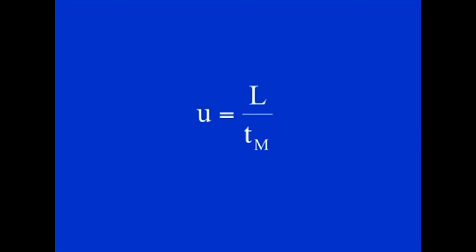Now, in the capacity ratio equation, the Tm, or transit time of an unretained compound through the column, is determined by the length of the column and the linear velocity of the mobile phase through the column, and it is given by this particular equation, Tm equals L upon the linear velocity, where L is the length of the column and Tm is the dead time as we were discussing. So, through the linear velocity, you can determine the transit time, or the time taken for the void volume to come out.